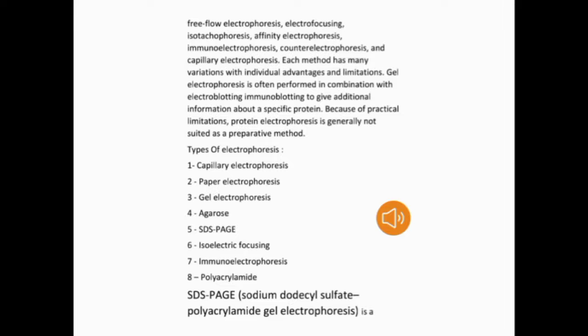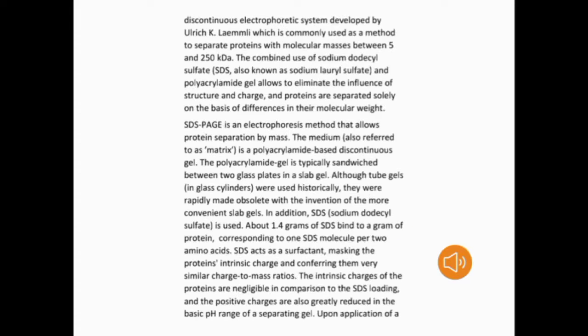SDS/PAGE, known as sodium dodecyl sulfate polyacrylamide gel electrophoresis, a discontinuous electrophoretic system developed by Ulrich K. Laemmli, which is commonly used as a method to separate protein with molecular mass between 5 and 250 kDa. The combined use of sodium dodecyl sulfate and polyacrylamide gel allows to eliminate the influence of structure and charge, and the proteins are separated solely on the basis of differences in their molecular weight.